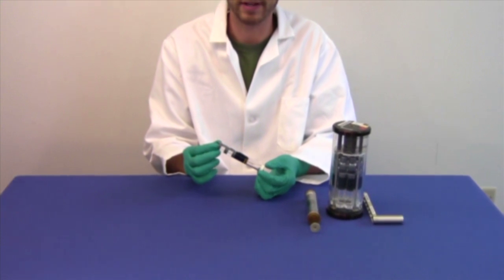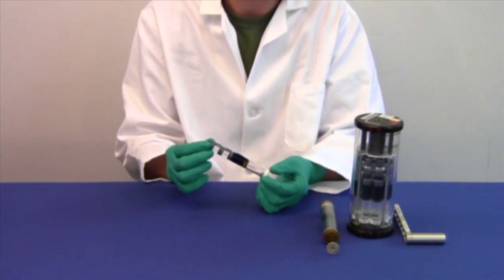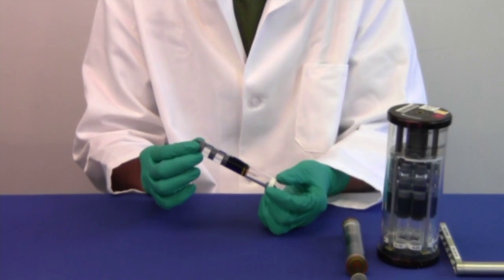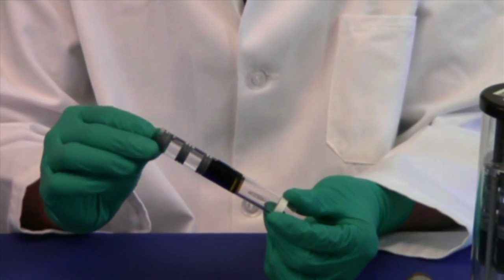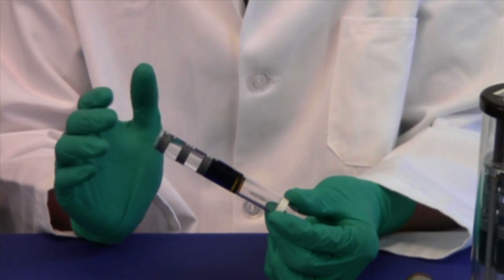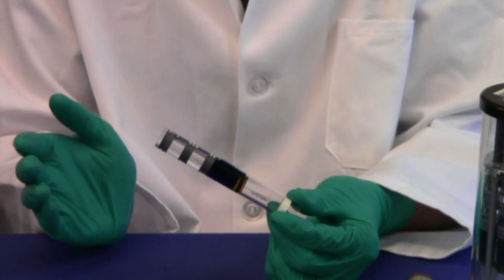Depending on your experiment, it can be configured with up to four chambers that hold different materials. Then, by pushing on the rubber stopper, you can mix the first two chambers, feeding something you have growing or starting a chemical reaction.